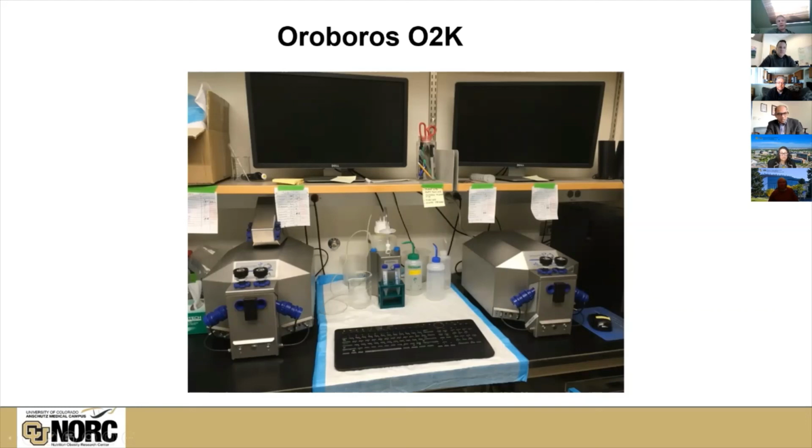So in the end, once you get comfortable with the system, there's a lot more art that goes in with the science. You just kind of know when you can add stuff and you know when you can't add stuff. The other thing on the system is we no longer use oligomycin. Oligomycin is used all the time in the Seahorse, and you get to use it over there because you throw the cartridge away. If you put it into this system, it's a bear to get out of it.